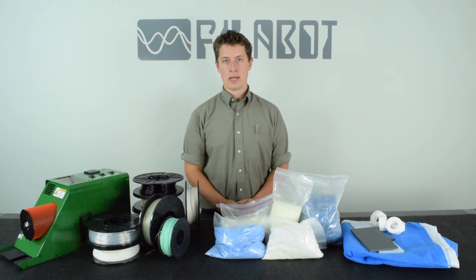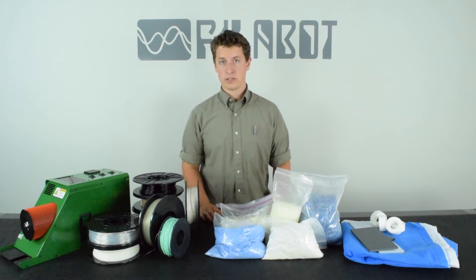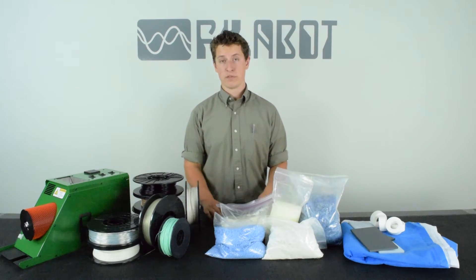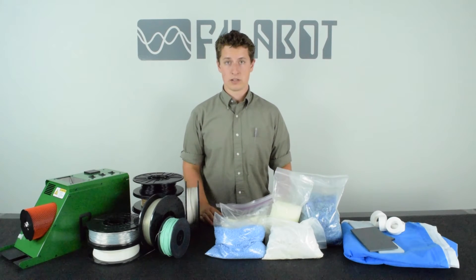Hello, I'm Tyler from Philobot. In this video, I'm going over our plastic testing service. This is something that we've done in the past, but we've revamped it to provide you with an even greater level of detail for the plastics that you send to us.